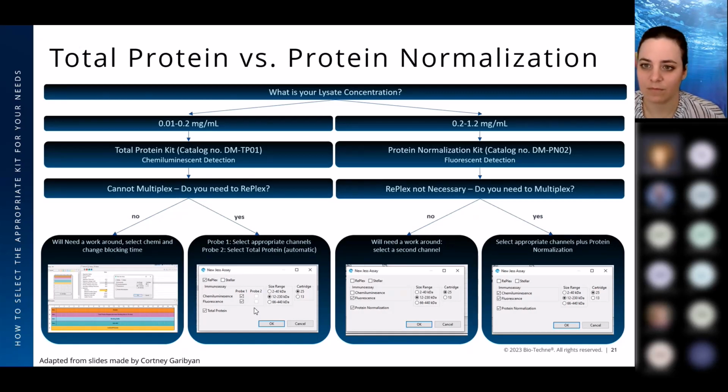Protein reconstitution. It's Jennifer here from tech support. So the reconstitution reagent does need to be at room temp because it contains the DMSO, so we don't want it to be too viscous. That's why it's kept at room temp. Okay, so it's 18 to 28 degrees, and the normalization reagent is minus 70 to 80. So that's the reagent that you don't want to keep out at room temperature for a very long time. So that's what you'll leave for the last step. Yes. So technically, we're doing everything correctly, and that wouldn't create any problems, right, for protein effects.